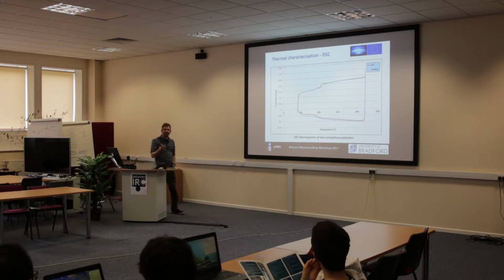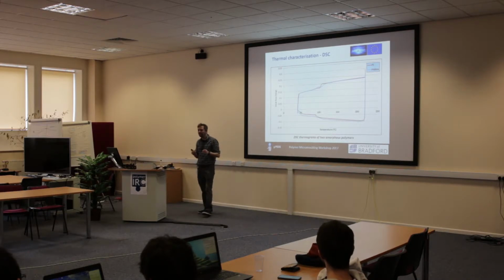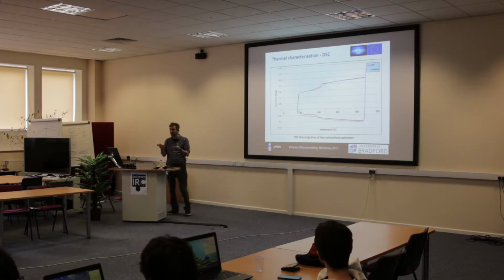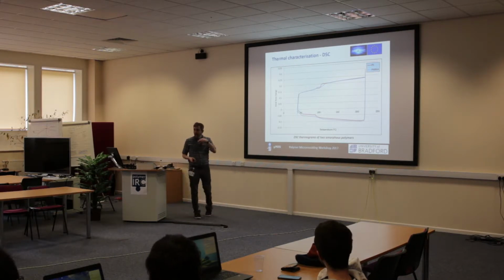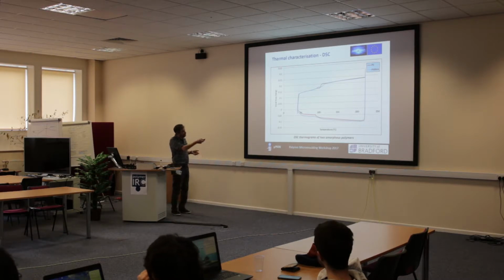So if you think of polystyrene rulers or acrylic rulers and stuff, they're pretty glassy, okay? They're not very flexible. They're kind of like a glass. If you hit them with a hammer, they will smash, okay? They'll splinter. If you hit polyolefins with a hammer, they won't. They'll just absorb energy, okay? Unless you go to about minus 50 degrees C, in which case they go through this transition similarly, and they will become glasses, okay? So this is also capable of measuring this glass transition temperature.